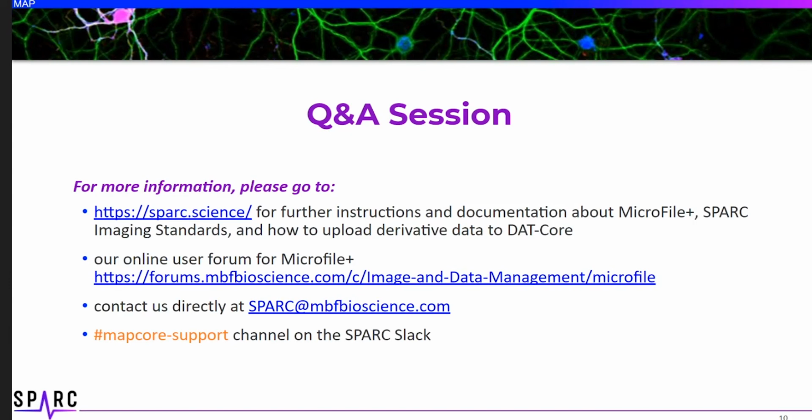And so when you're creating your data to be open and more FAIR for others to use, I think it's really important to make sure that that metadata travels with the file. I'm not aware of Fiji being able to add or augment metadata within your file. So that may be a key distinction between using MicroFile Plus or not.